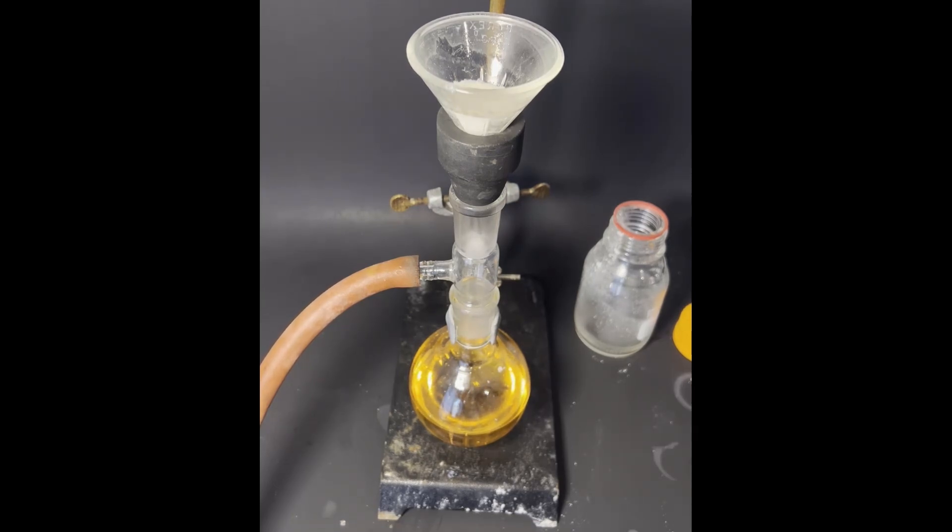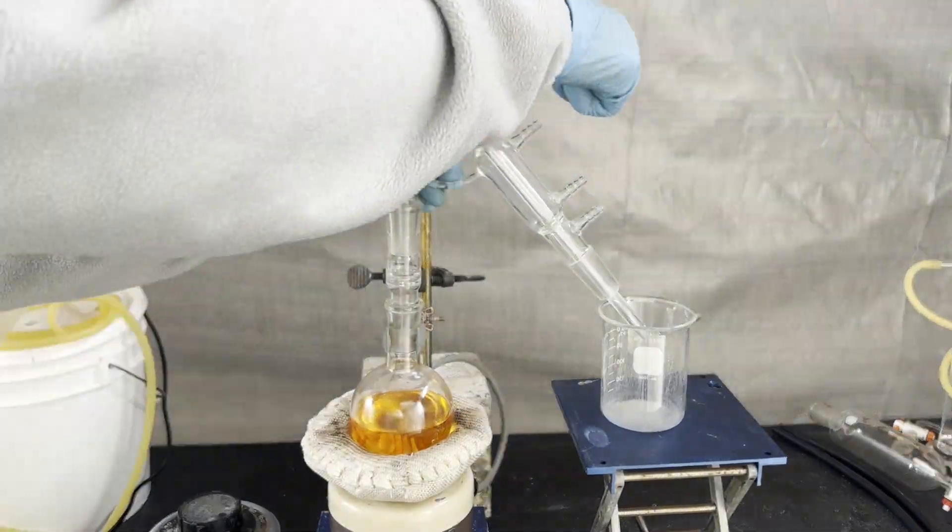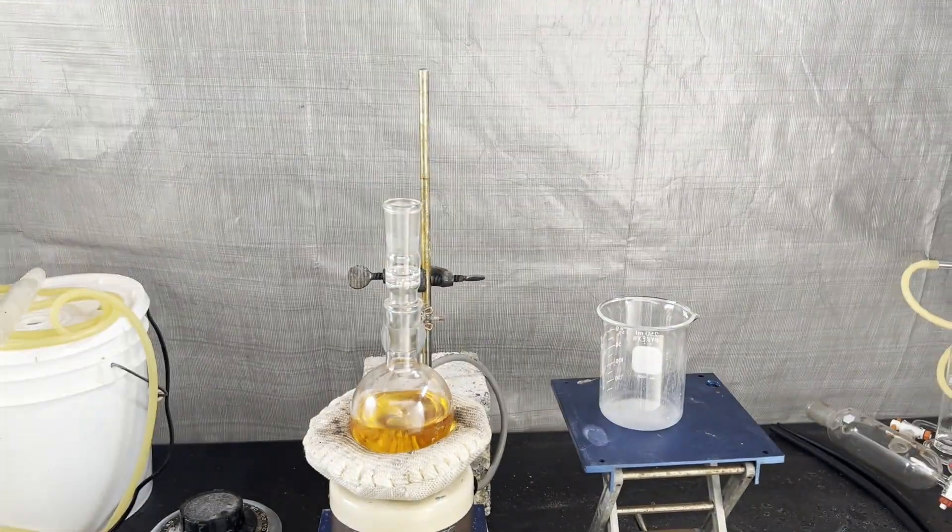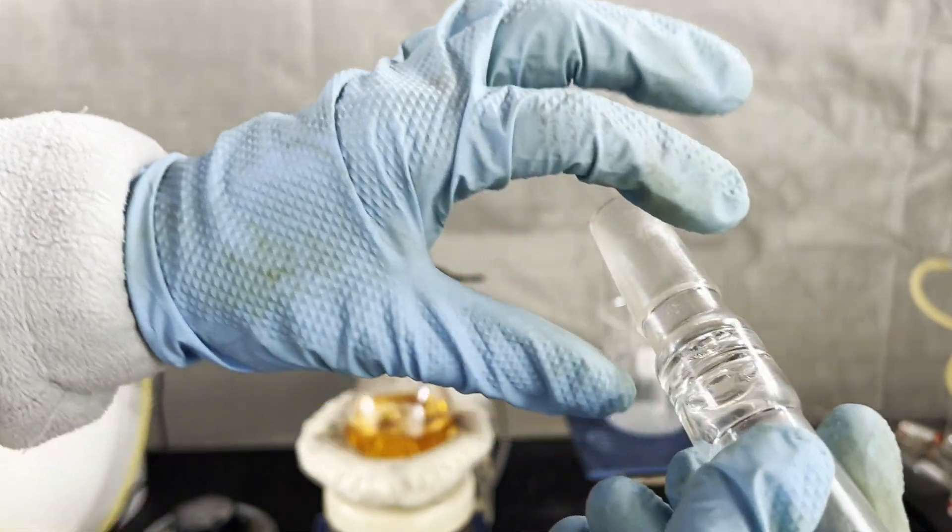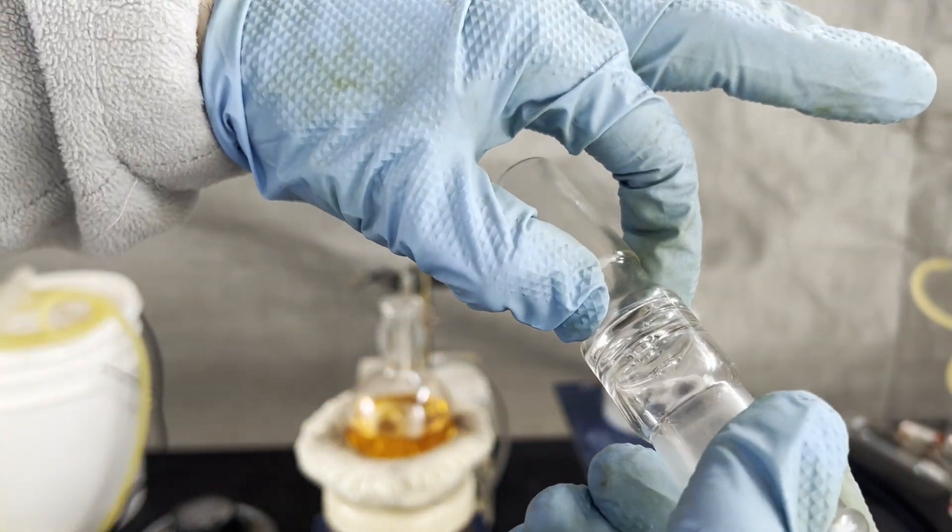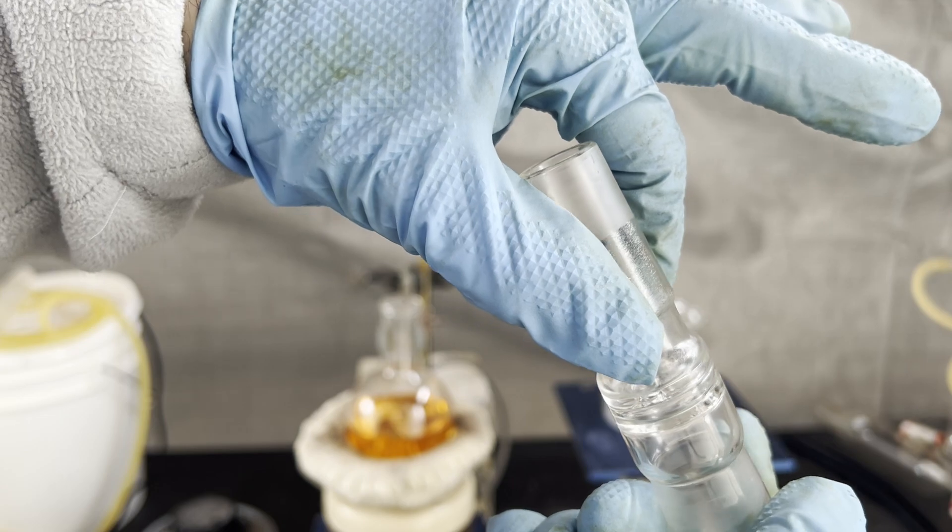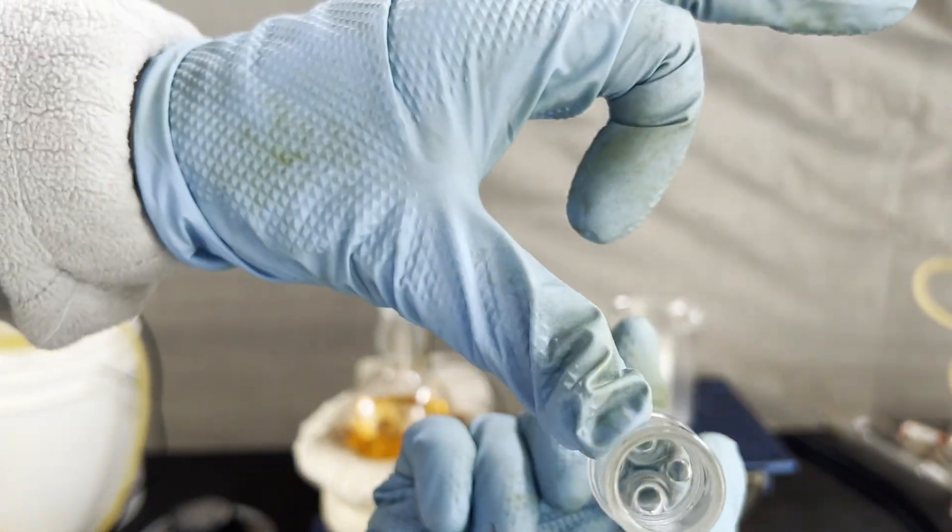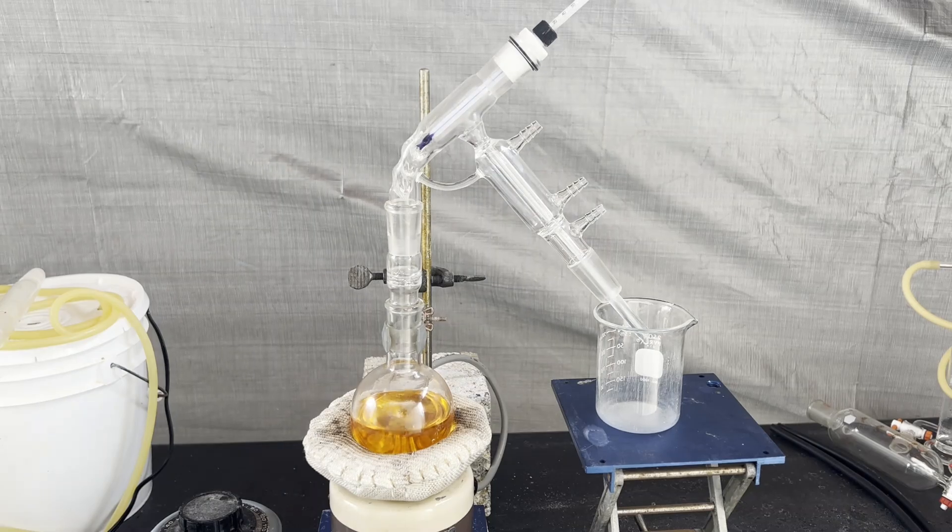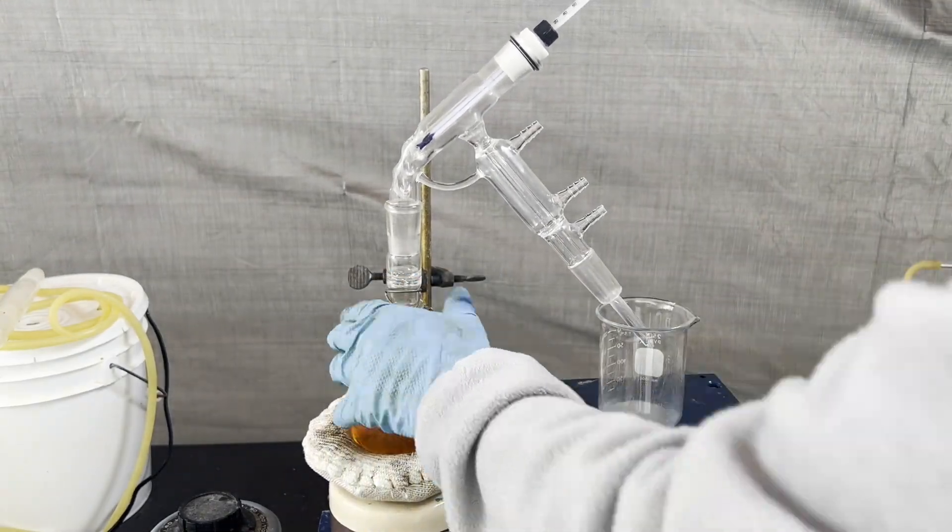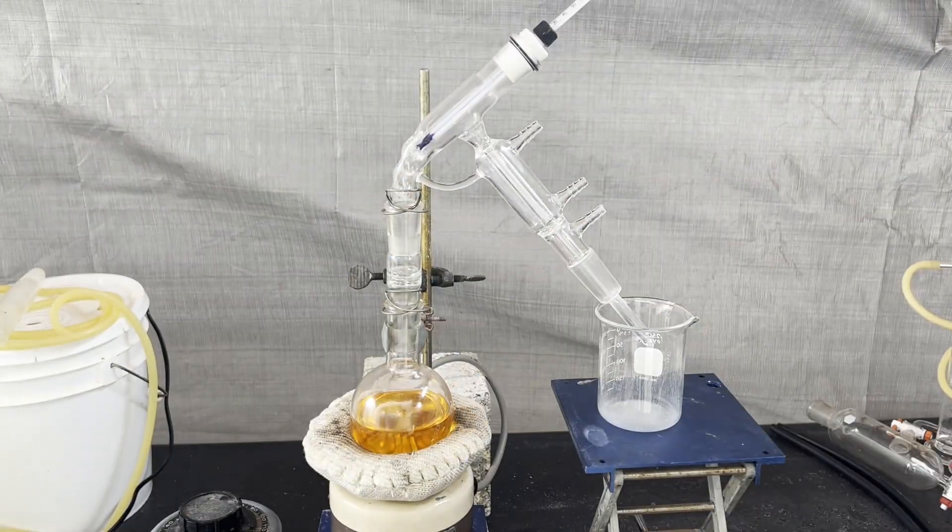I then used a separatory funnel to isolate the organic layer, dried it with anhydrous magnesium sulfate, and filtered it directly into the flask I'm about to distill from. A neat piece of glassware I own is this bump trap. It's a simple glass joint with two perpendicular two-holed circular glass discs fused into it. In the trial run, this distillation foamed a lot, which necessitated the use of a bump trap.